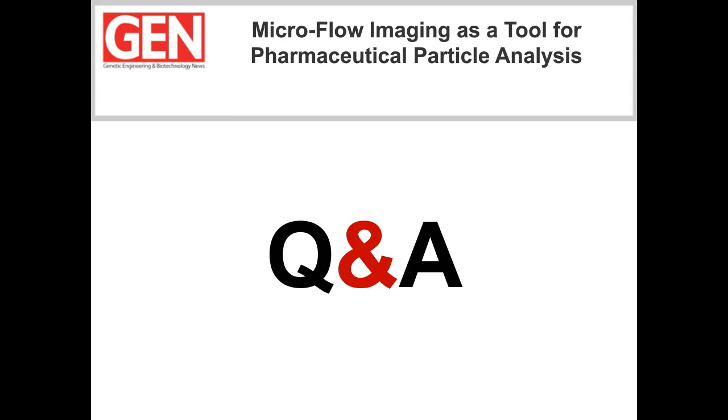And that's the reason why we took the aspect ratio over circularity, to have more power to separate between the populations. I hope this will answer the question.